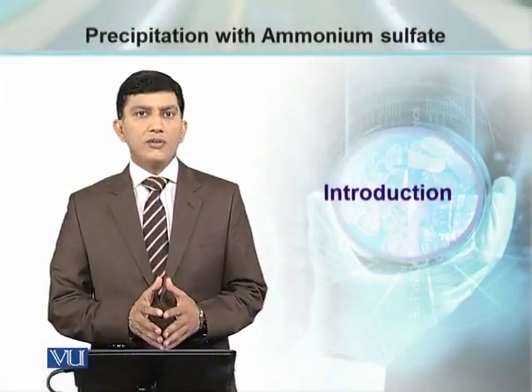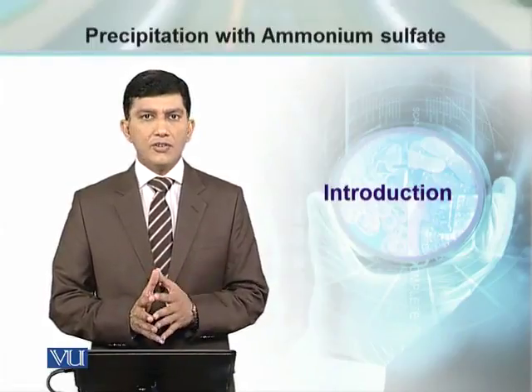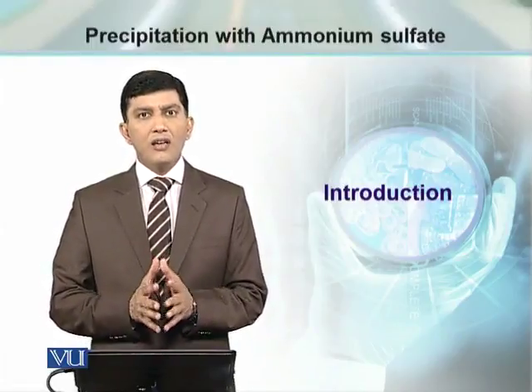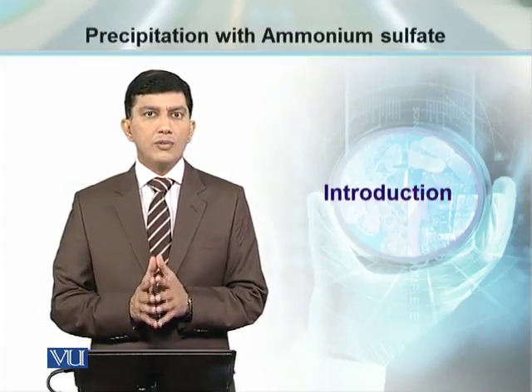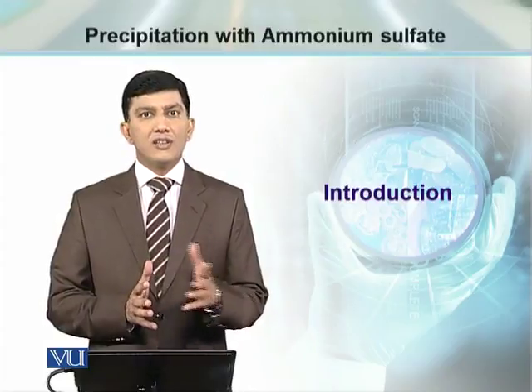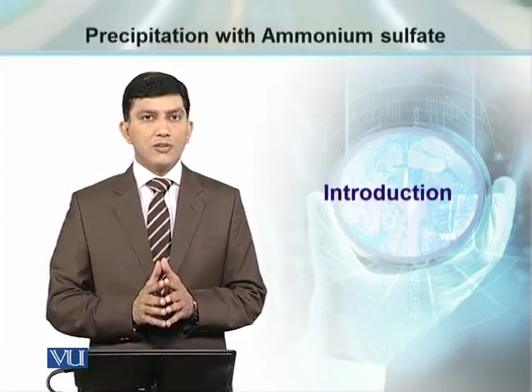प्रोटीन आइसोलेशन के बाद जो नेक्स्ट स्टेप है, उस प्रोटीन को हम यूज़ कर सकते हैं फॉर फर्दर एनालिसिस, और we may need to proceed further for concentration of proteins, means to concentrate the proteins. This is also referred to as precipitation of proteins.